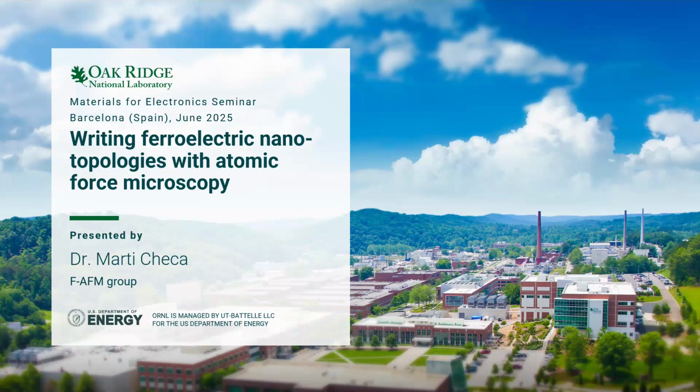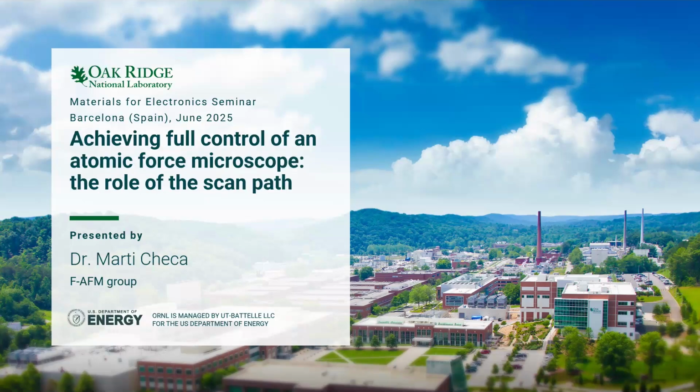Originally, when Ignacy asked me to talk, I sent him an abstract, but then he told me it was a 45-minute seminar. So when I was preparing the talk on the plane, I wanted to talk a little bit more big picture. I'm going to talk about manipulating ferroelectric topologies with an AFM, but I'm going to give a big picture of what type of things we can do when you achieve full control of an atomic force microscope.